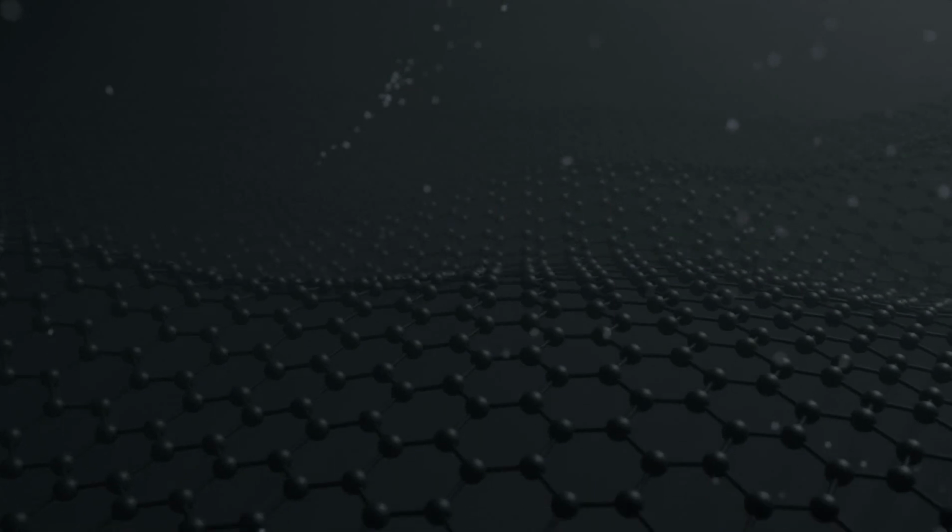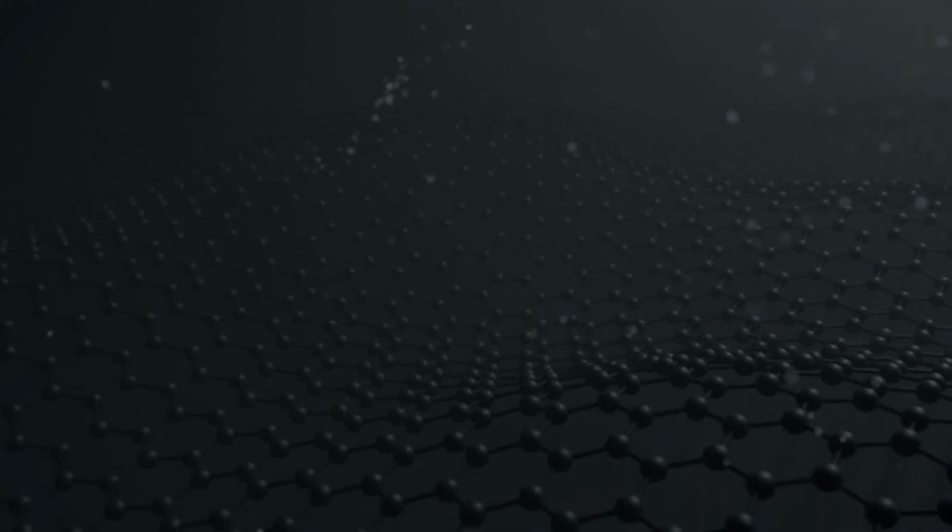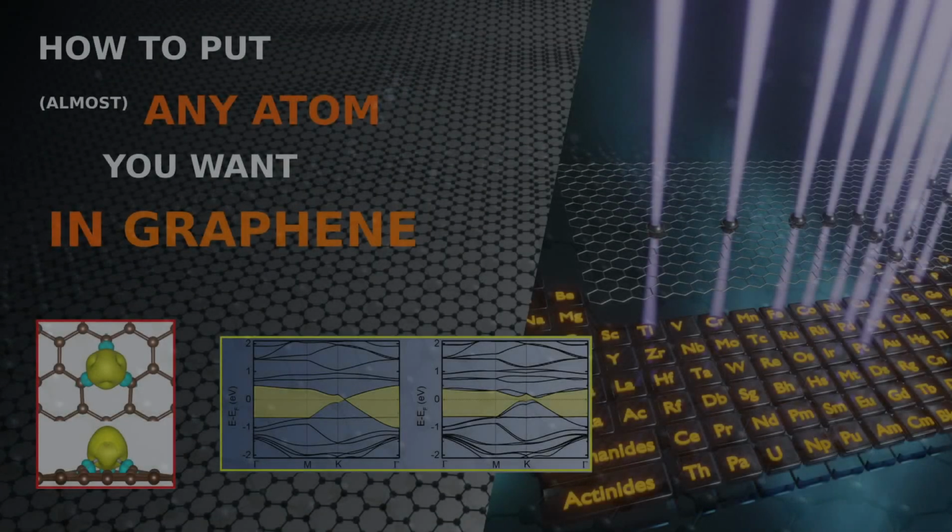In this work, we combine the application of global and local parameters in an aberration-corrected scanning transmission electron microscope, or STEM, to demonstrate atomic scale precision patterning of atoms in twisted bilayer graphene.